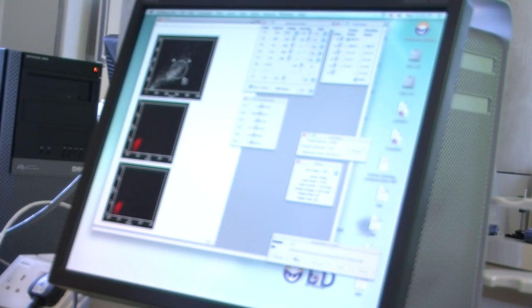Yeah, we're up to about 5,000, so we're almost there. And then our actual samples. So far, no one's lost their pellets, no one's lost their cells. So brilliant, those 2. Now, of course, the other 3 of you may or may not have cells, but we should have. From what I could see, everyone had good technique, so that's fine. And actually, in some ways, you're better at it when you're new at it because you're more careful.